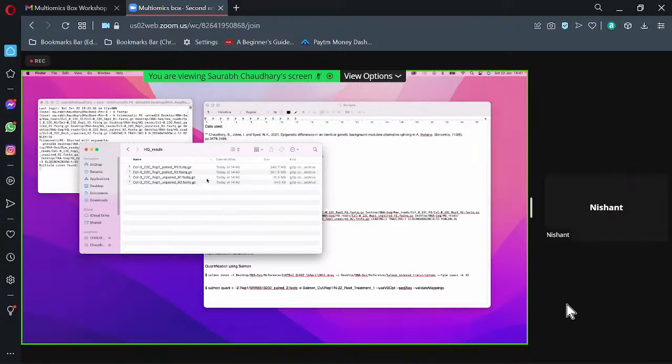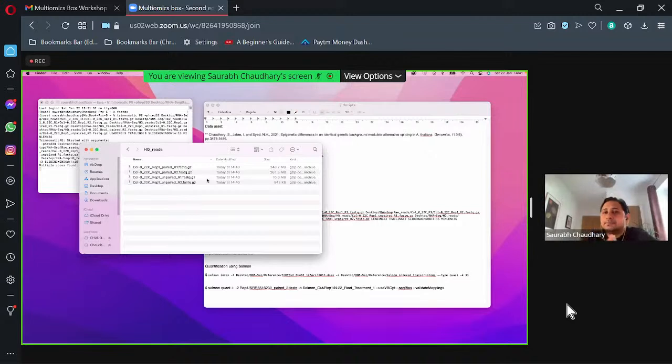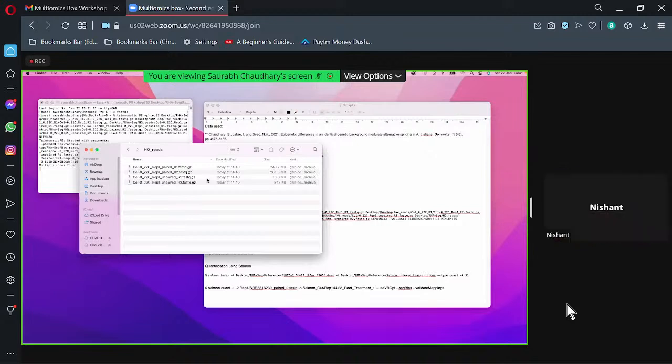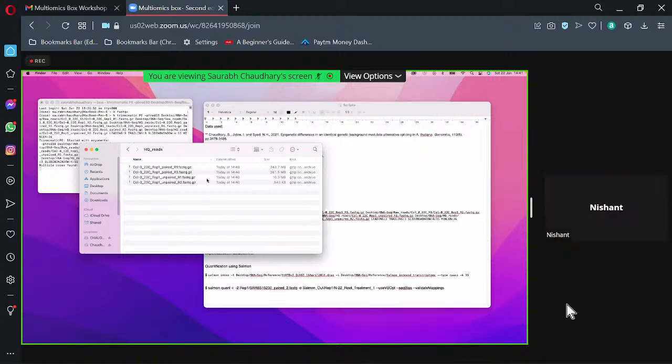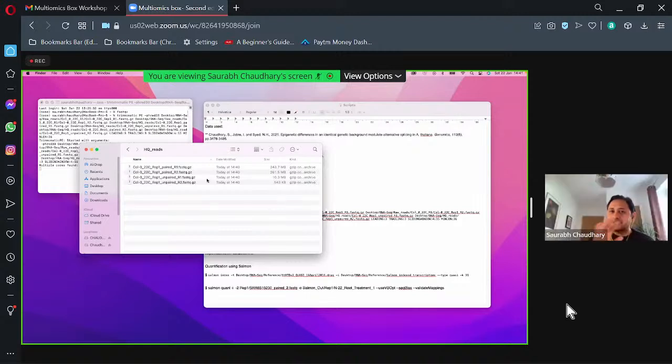Okay, so these FastQ files you have downloaded from the Illumina software, the Illumina data. And then basically you are trimming them, running them on FastQC to see. So how is the chronological order decided? First you download FastQ files from the Illumina software. Illumina is not a software. Illumina is a sequencer machine.